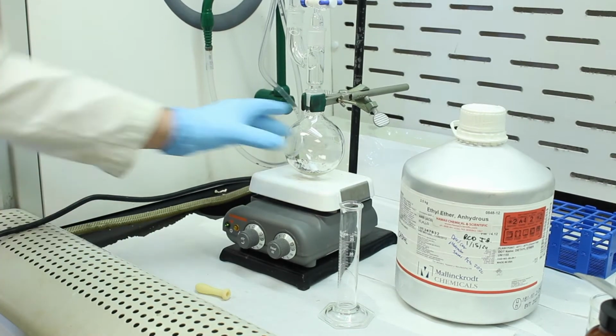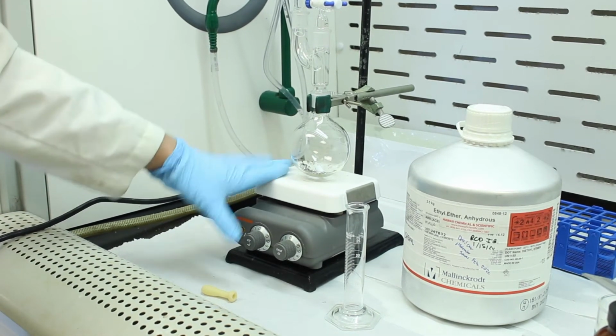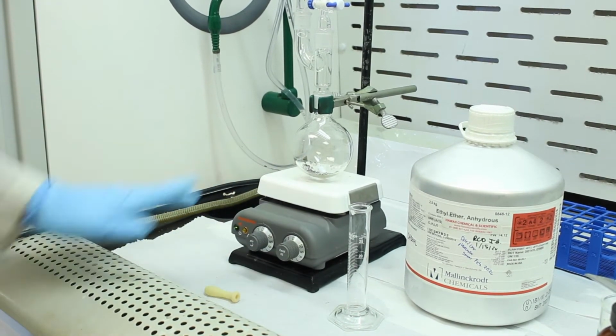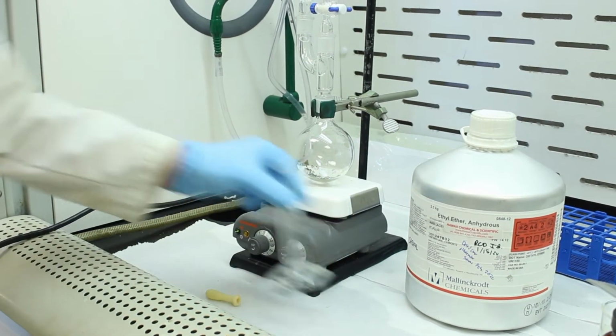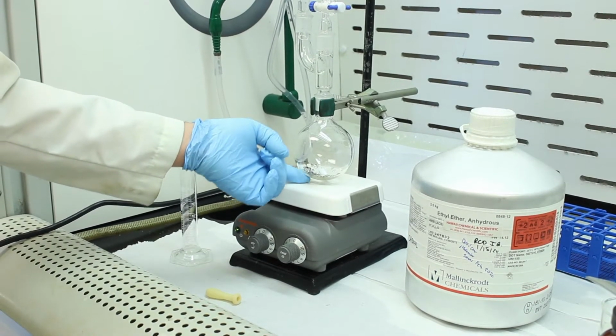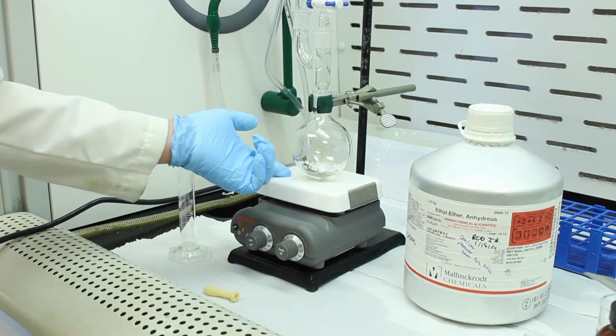Okay, so we've allowed our apparatus to cool, and now it's sitting over a hot plate. We're going to use the hot plate a little bit for heat, but mostly for the stirring. Okay, we're going to add our solvent now. Oh, I should have mentioned, the magnesium turnings were already in there when we flame dried it. So that also helps to dry the magnesium, making sure there's no water adhering to it too.